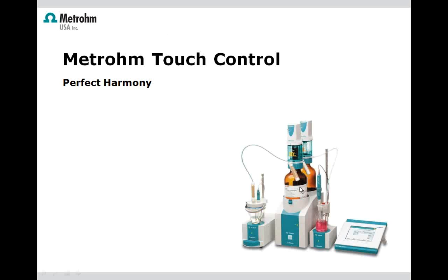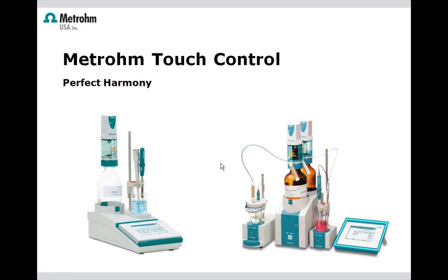Here you're seeing a diagram. You're seeing a system consisting of a titrator, a stirrer, and another stirrer on the other side, and it's being controlled by a 900 touch control system. Now to the left, you're seeing what is called a TI Touch, which is an integrated version.